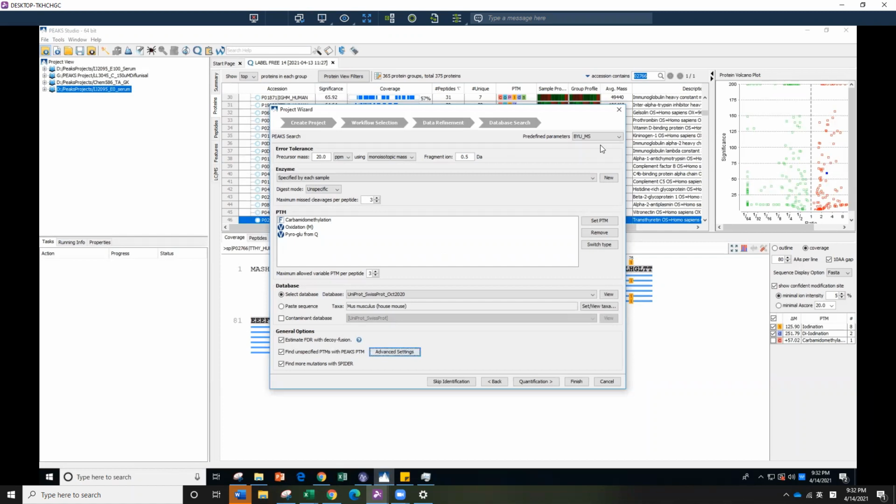Okay, but for folding groups that are listening right now, you go to predefined and go to CD iodine on a different computer.